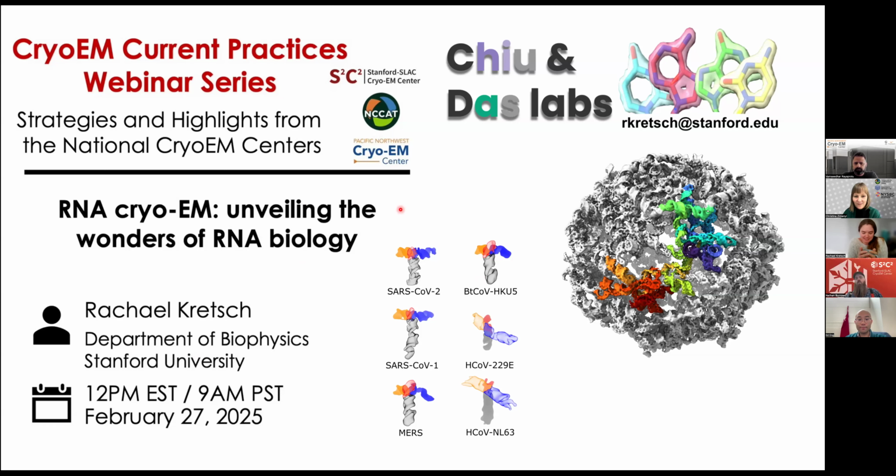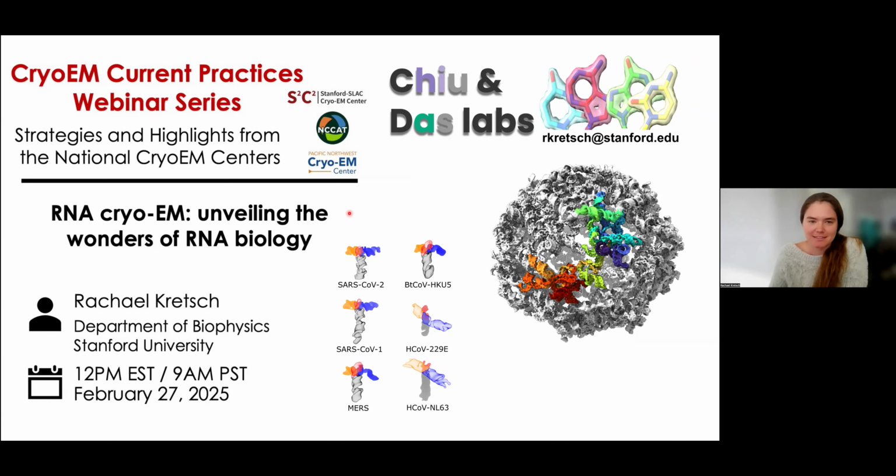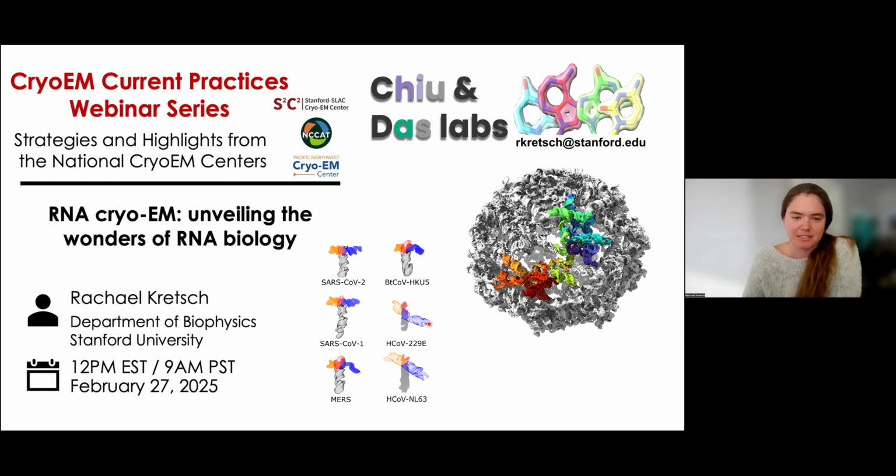So today I'll be talking about some, I guess, more practical examples of some structures we've solved, and how our hope is that cryo-EM will make a big impact with RNA structural biology, and that will lead to a big impact in more functional RNA biology studies.